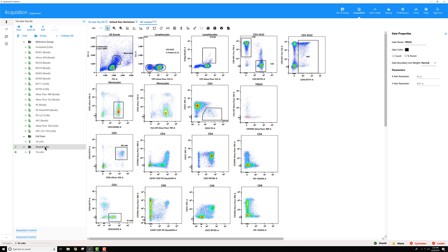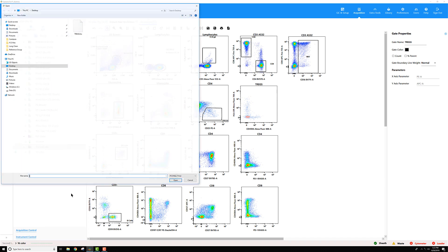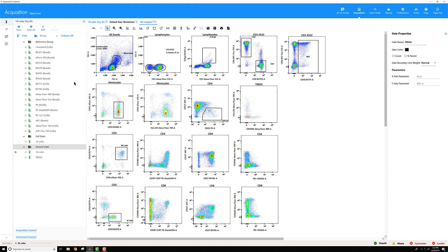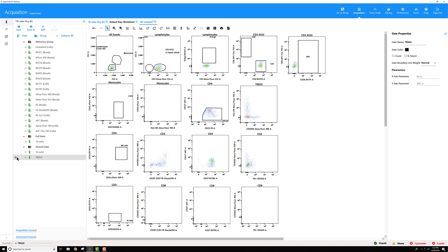Then if I want to import that file into my experiment, I can right-click on my group here, go down to Import FCS File, select the file, and move to it. Then you can see once it loads, it's only showing the events that fell on that TREG gate.